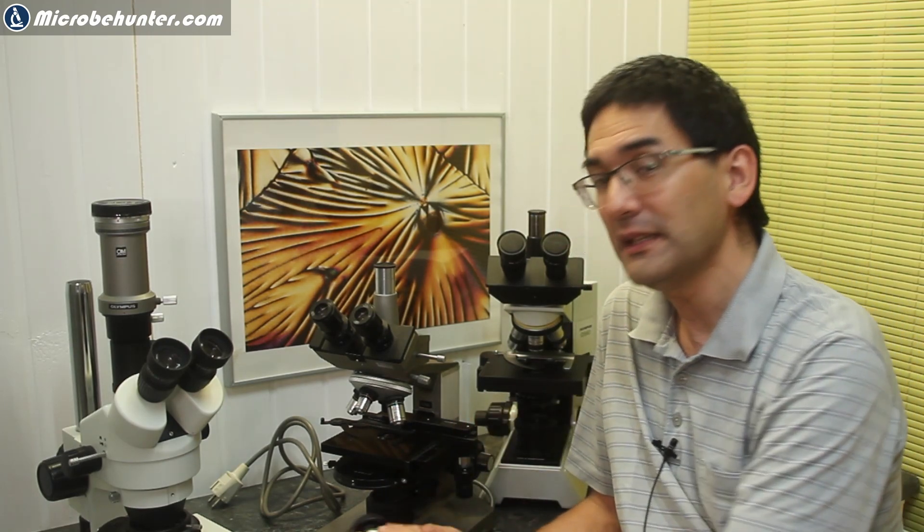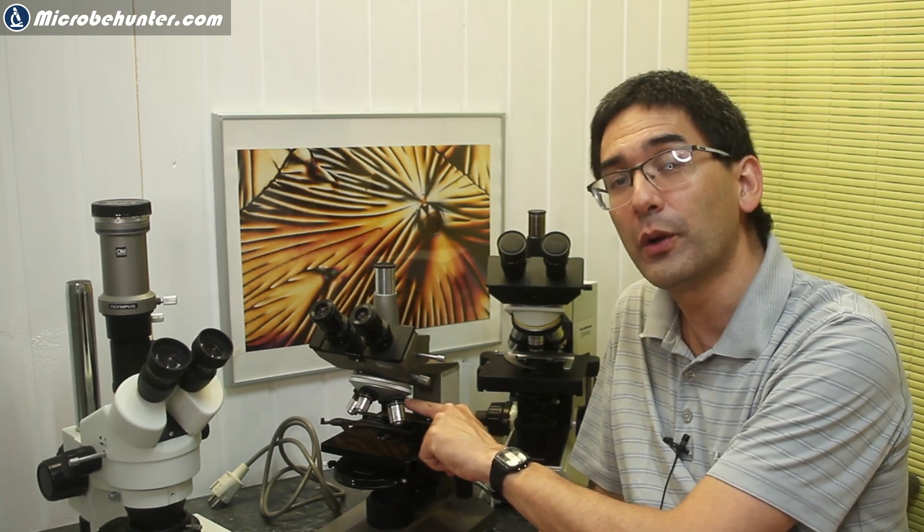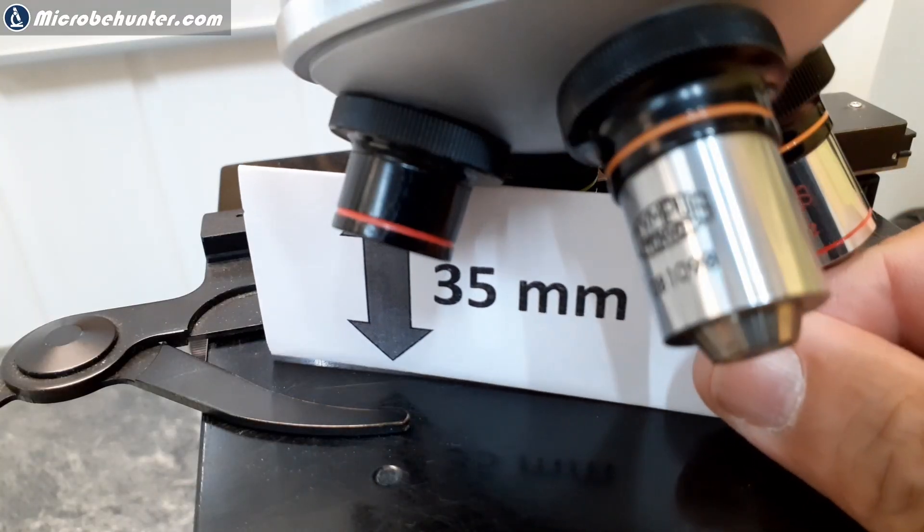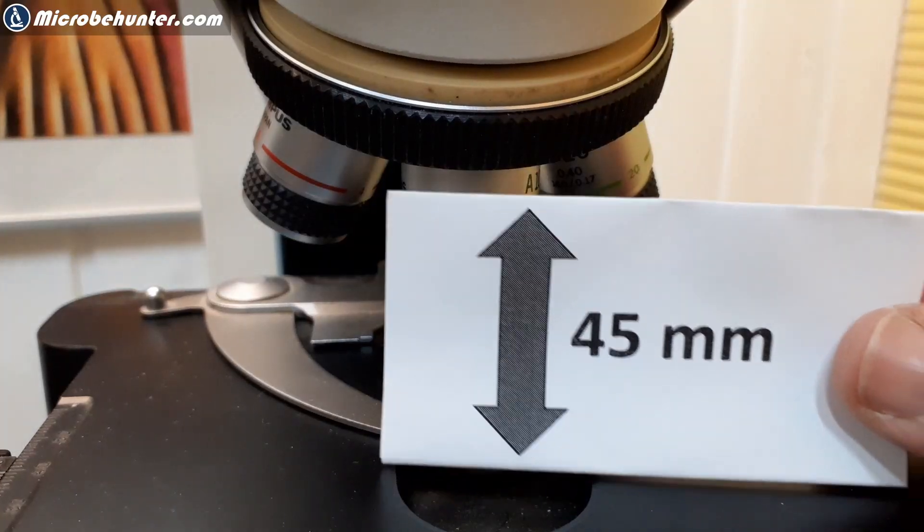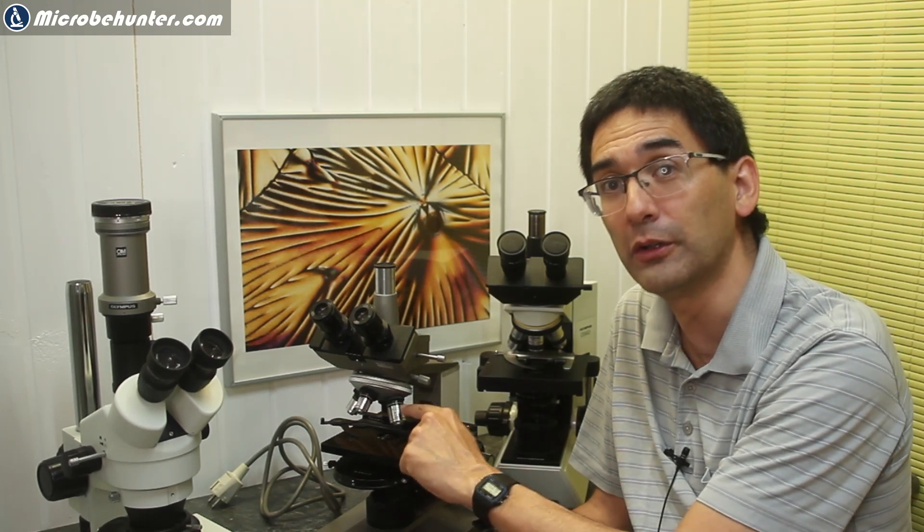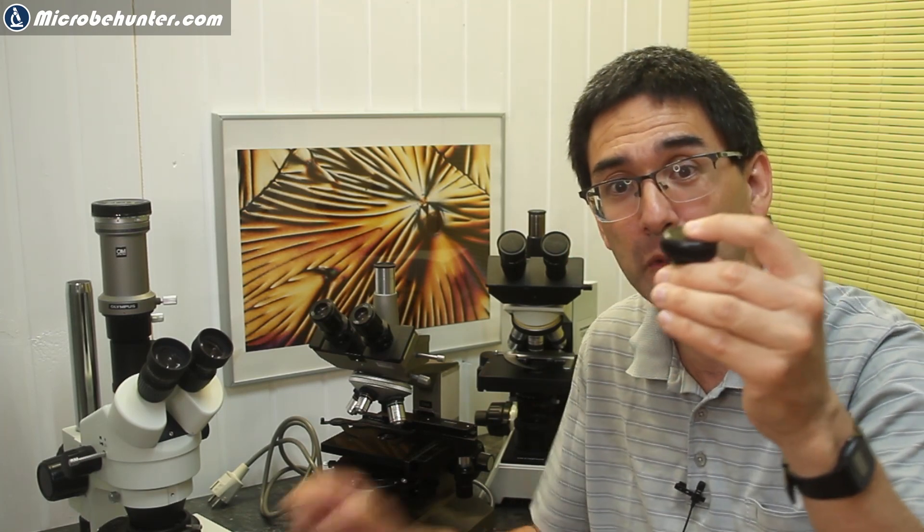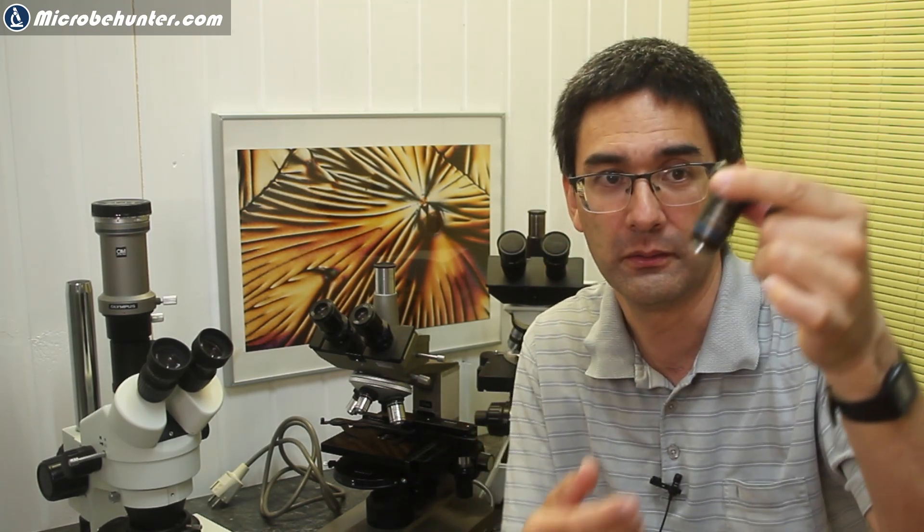This means that the distance from the stage to the place where the objective is mounted at the revolving nosepiece is 35 mm here, and over here it is 45 mm. So the distance between stage and the place where the objective is mounted is smaller here. This is also why the objective can be smaller. Some people call them short barrel objectives. And this one is a long barrel one, a normal one.